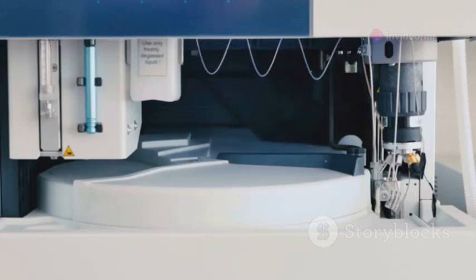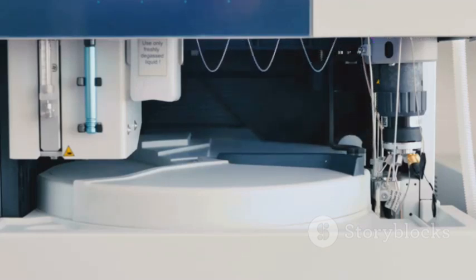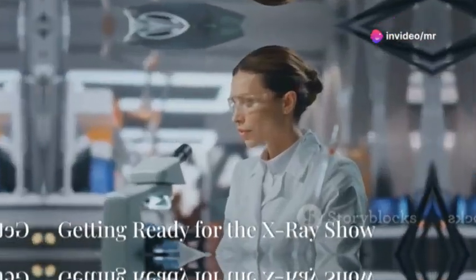XRD machines come in different shapes and sizes. Some are small and portable, while others are large and complex. But they all work on the same principle of X-ray diffraction.